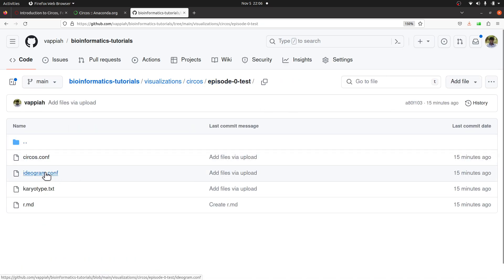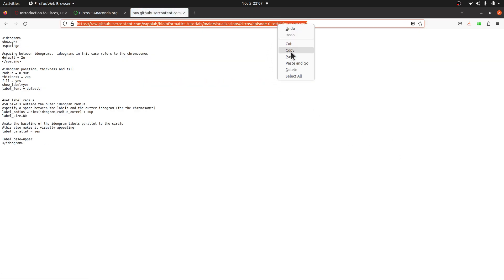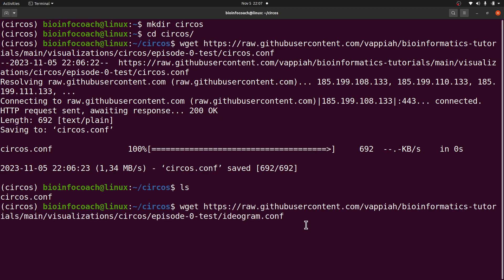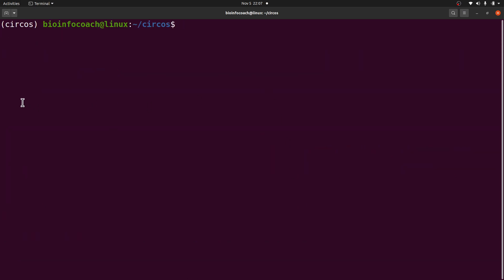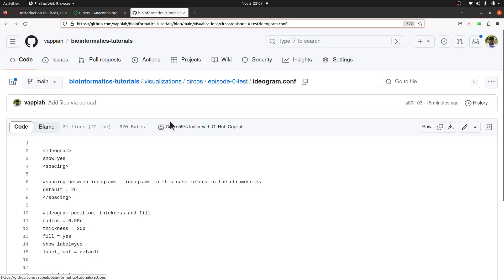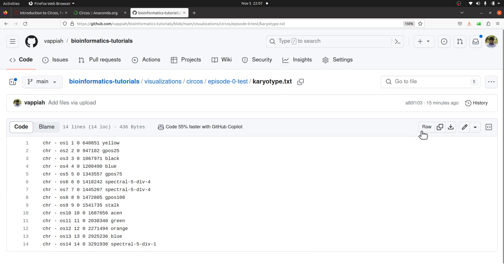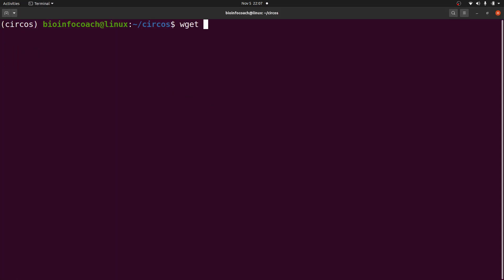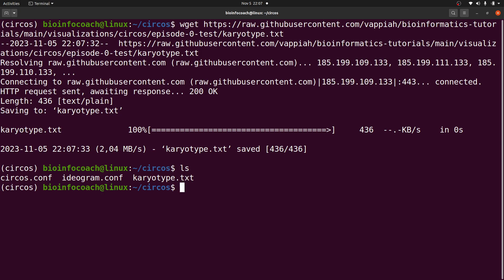Now let's download the other files. I'll click the second file, come to raw, copy the link, come to the terminal, paste it, and download with wget. That's also done. Let's get the third one — karyotype.conf. Click it, come to raw, copy the link, and wget and paste it. If we do an ls, we'll find all three files there. So we have everything we need to test Circos.